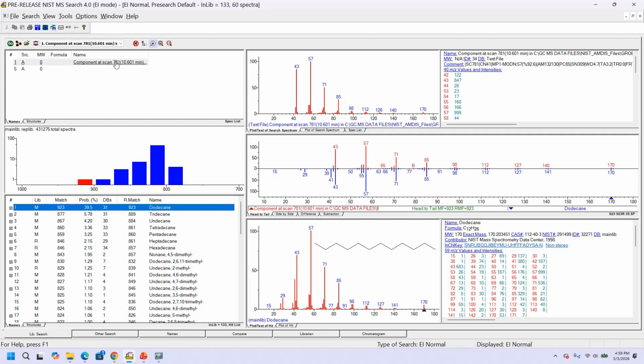If we wanted to search this by a reverse search here, we would need to change the settings if you wanted to get the best results. But of course, like I said, you could just go down here and instead of clicking on match to sort, you can click on reverse match and it'll be the highest and sorted in the list here. But the only problem is if it doesn't come in through the pre-search, you might take out a reverse match that would be useful to you.